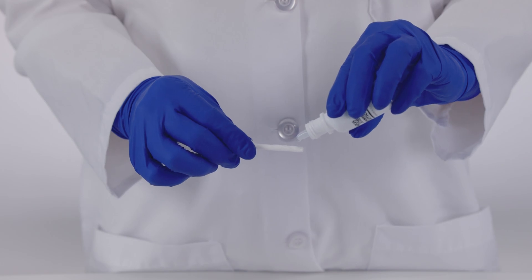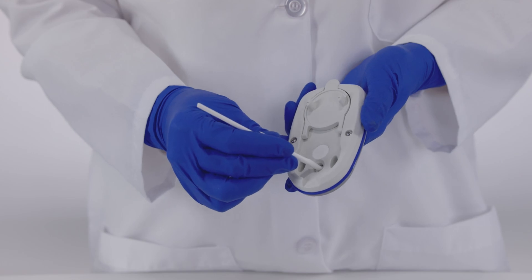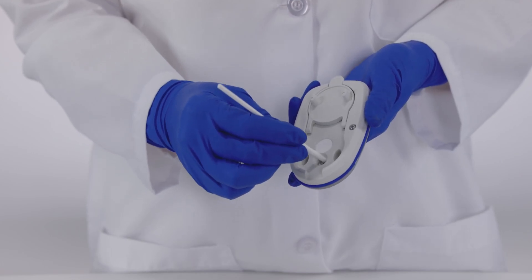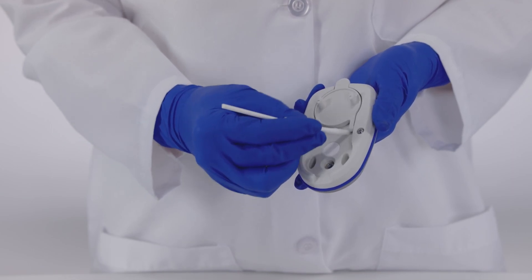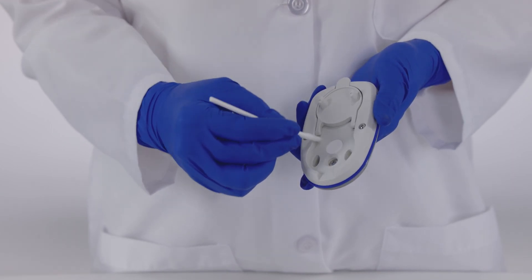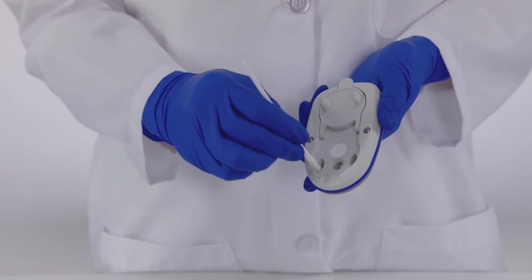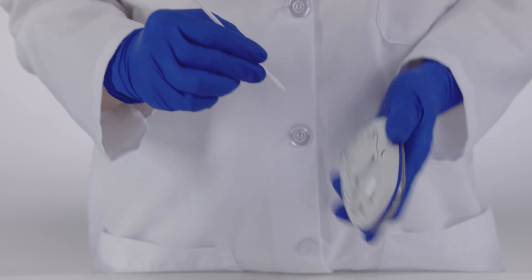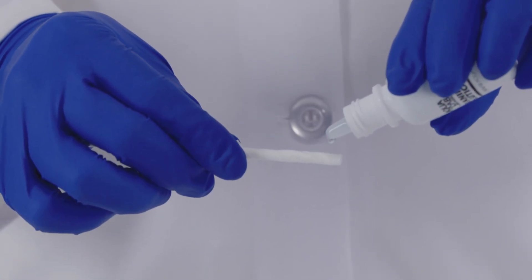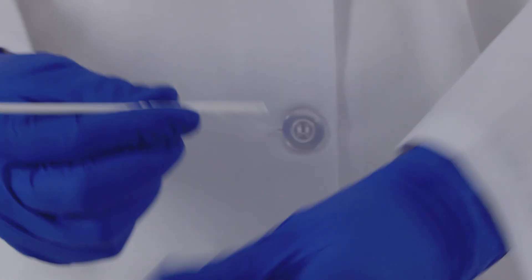First, wash the thermopile by wiping across the sensor. Then wash and rinse the nooks and crannies of the sensor chamber using the Kimwipe and the cleaning stick. Clean first with a clean Kimwipe and isopropyl alcohol or cleaning solution. Then rinse with a fresh Kimwipe and distilled water. Finally, dry with a clean, dry Kimwipe.